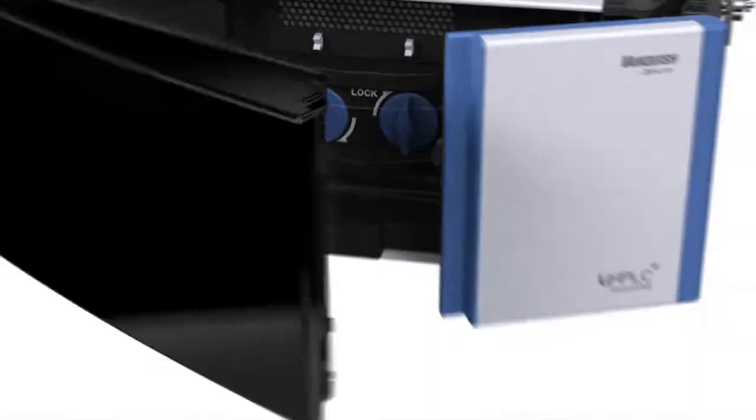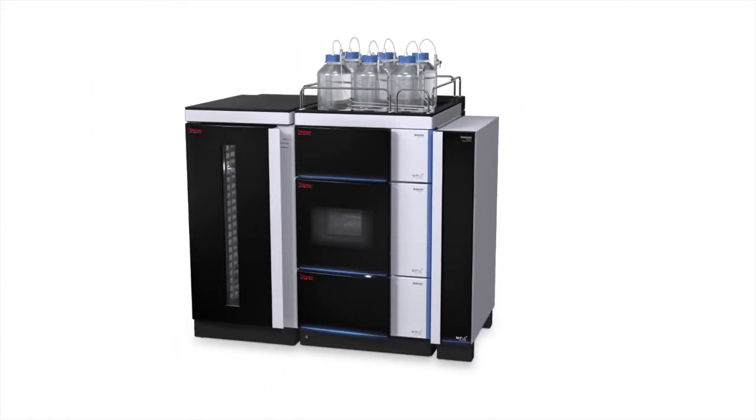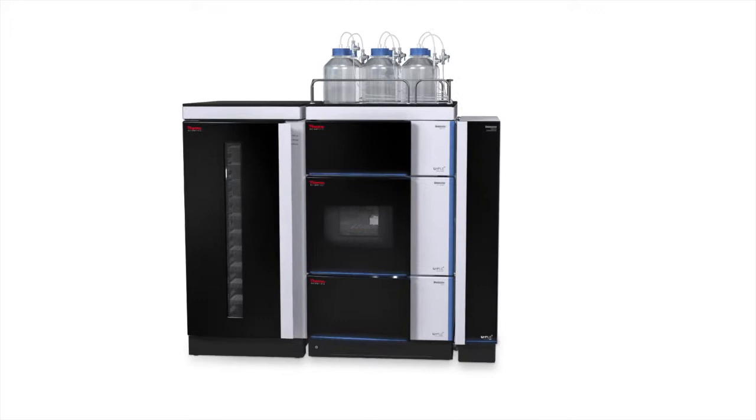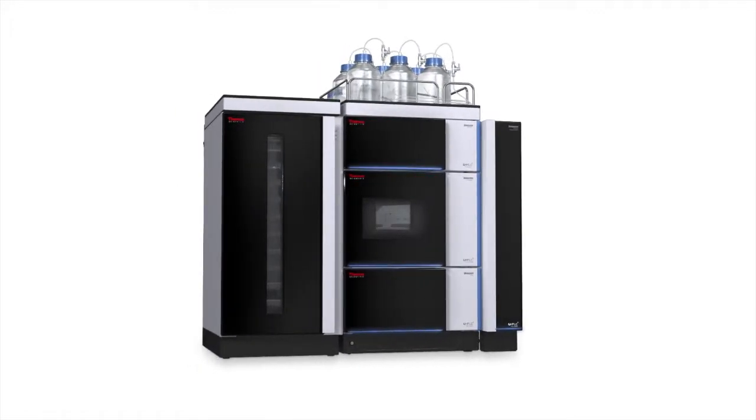The Vanquish system was designed to be an integrated system that addresses the needs of chromatographers performing state-of-the-art UHPLC. It appears as one instrument, but still offers the flexibility required by chromatographers in a clean, elegant design.